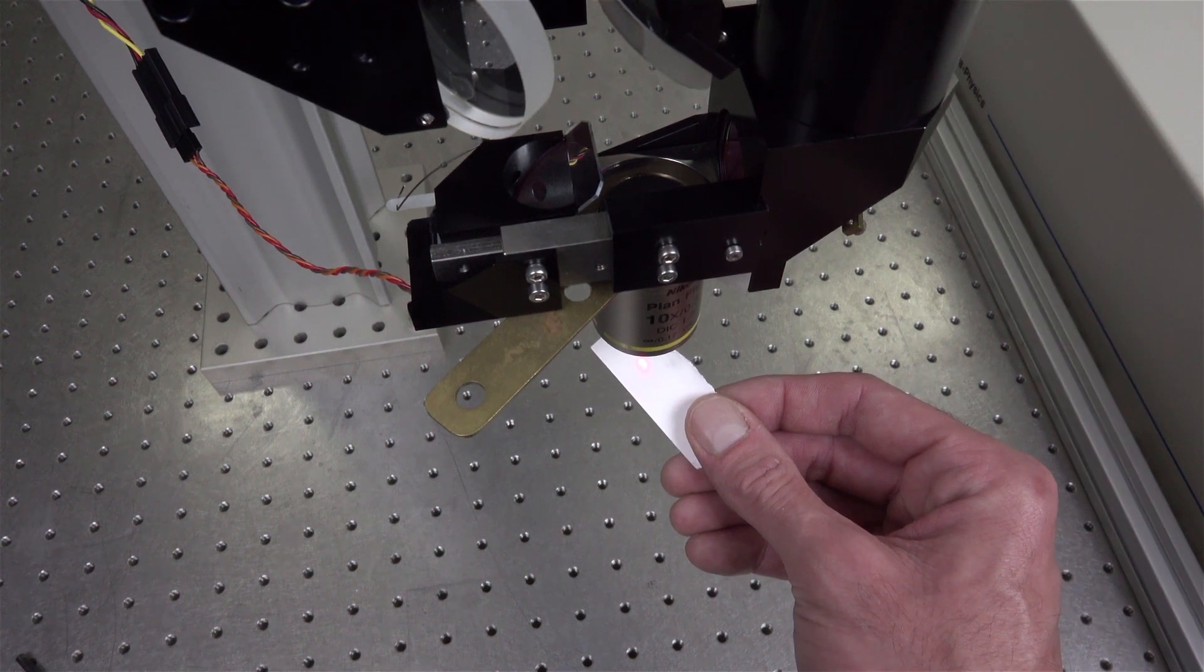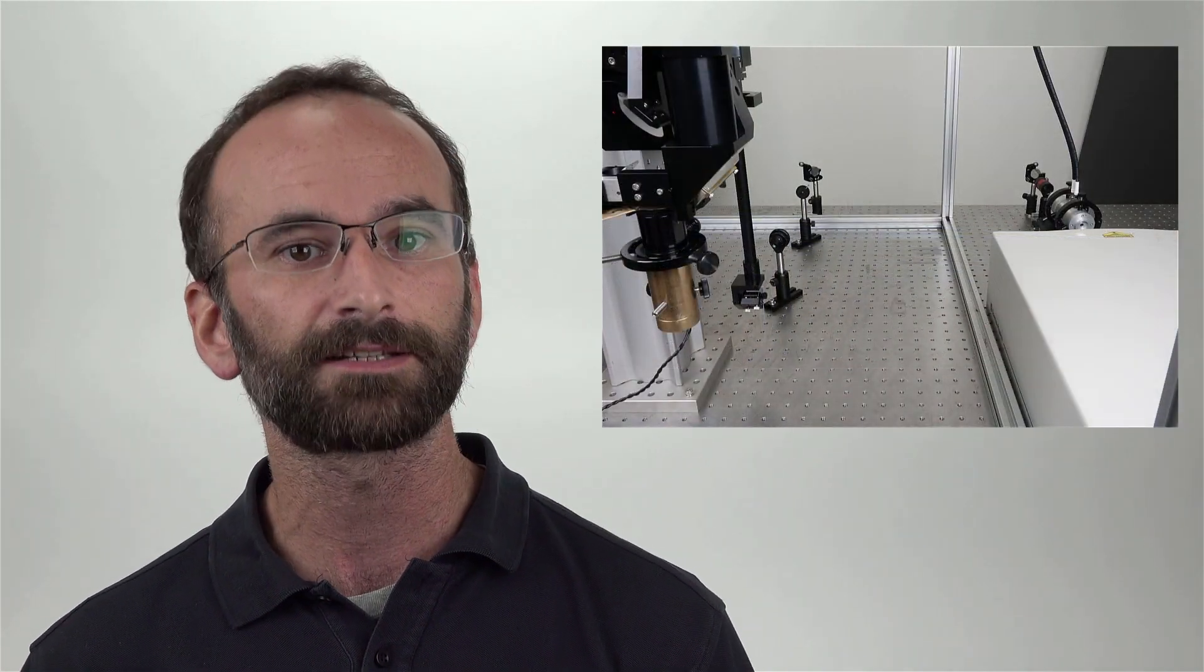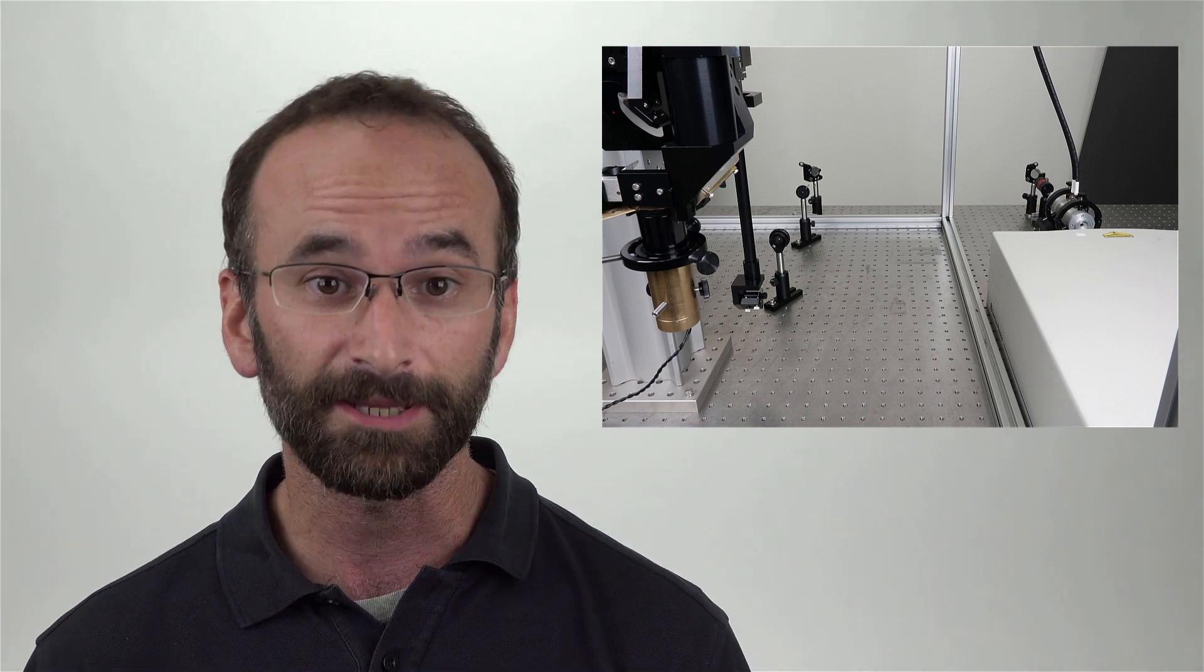Now your Sutter two-photon microscope should be optimized for imaging. This completes beam alignment of your two-photon laser scanning system, the Sutter Moveable Objective microscope. Leaving the two pinholes on the table will allow for quick checks and potentially easy corrections of the beam alignment of your system. However, if there are any unexpected variations, it's recommended to start the alignment procedure from the beginning as we have shown here. Happy imaging!